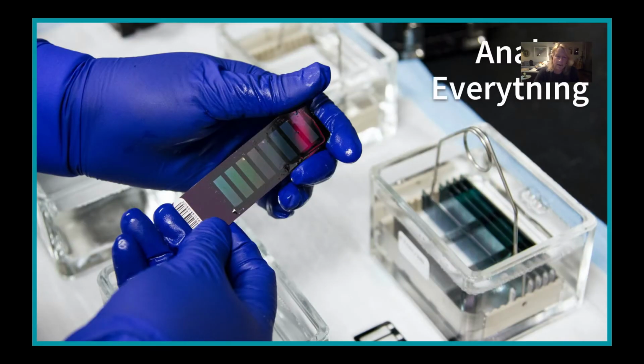This is an actual flow cell where the genetic material is placed by the researcher as it's processed in the various steps, which differ depending on what they're doing with the results. And this is what's put into the large machine for analysis to see what is the sequence in the particular section of DNA or RNA that they're working with.